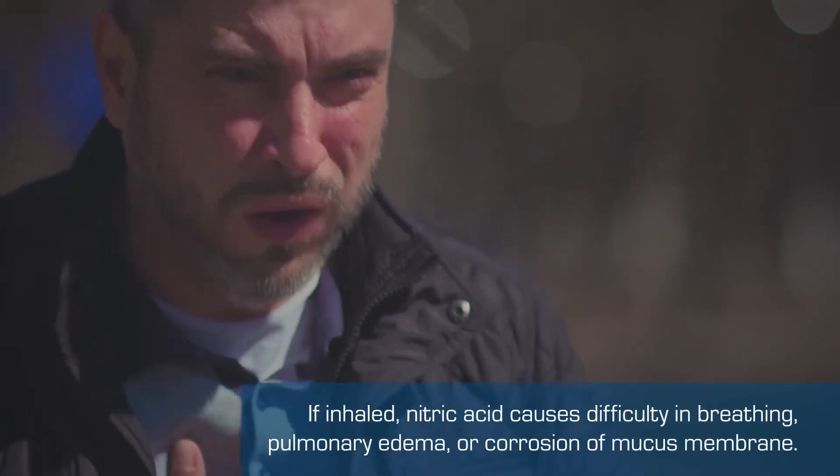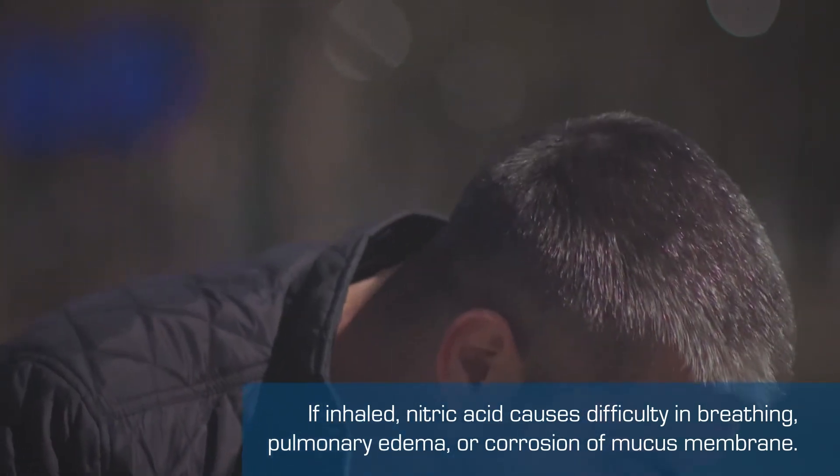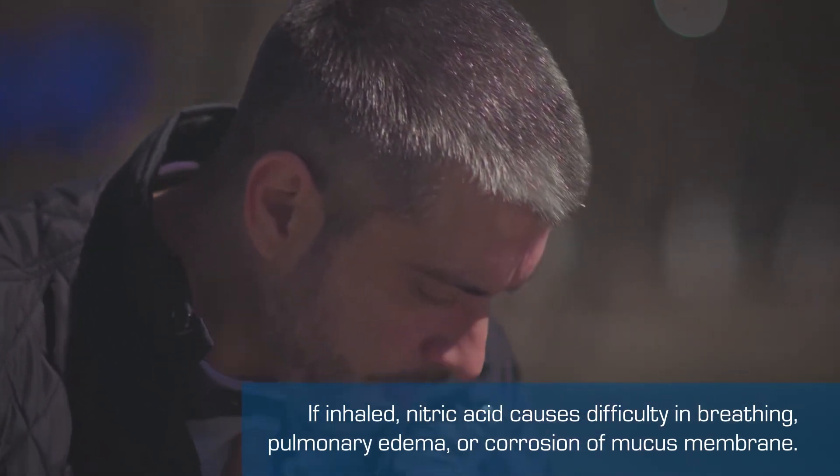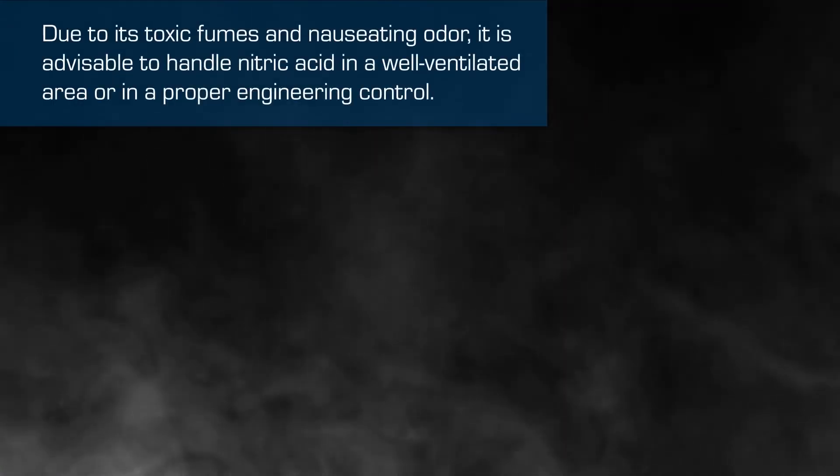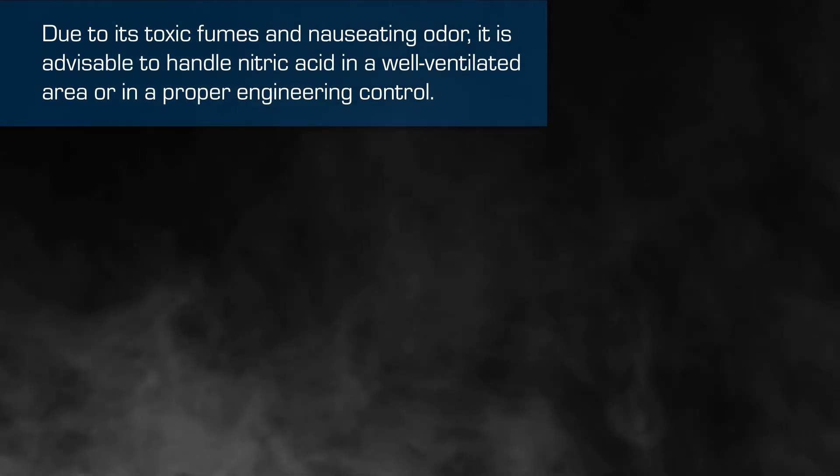If inhaled, nitric acid causes difficulty in breathing, pulmonary edema, or corrosion of the mucous membrane. Due to its toxic fumes and nauseating odor, it is advisable to handle nitric acid in a well ventilated area.